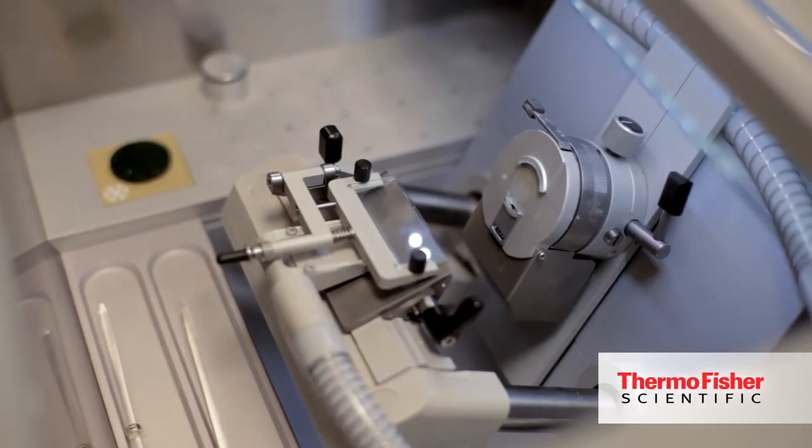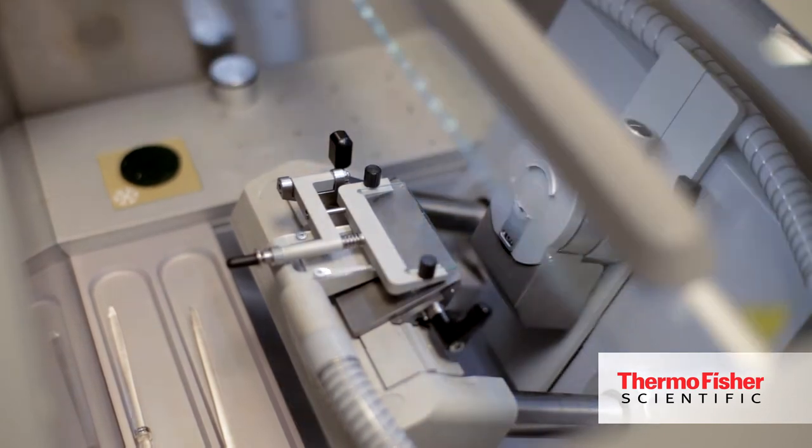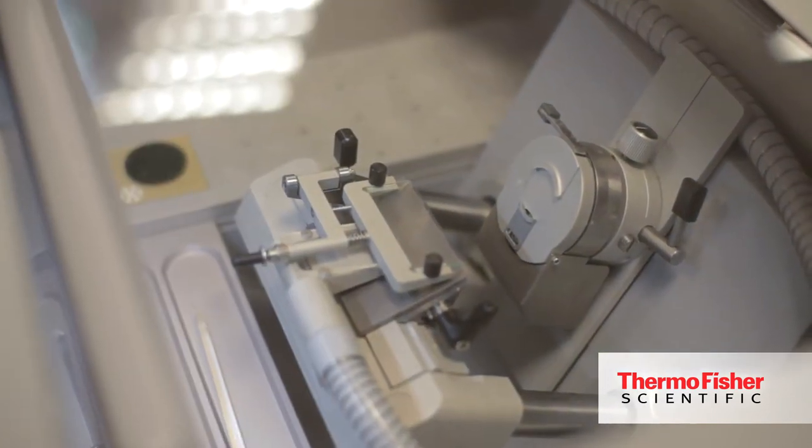We have a great new system that's optional on the NX50 and NX70 cryostats called Cold-D. This is our proprietary disinfection system where we use a hydrogen peroxide based disinfectant. It dispenses into the cryo chamber as a mist and it quickly kills bacteria and other pathogens within just 50 minutes, and it can be done while the cryostat is still cold, cutting down tremendously on downtime and increasing your workflow and efficiency in the lab.